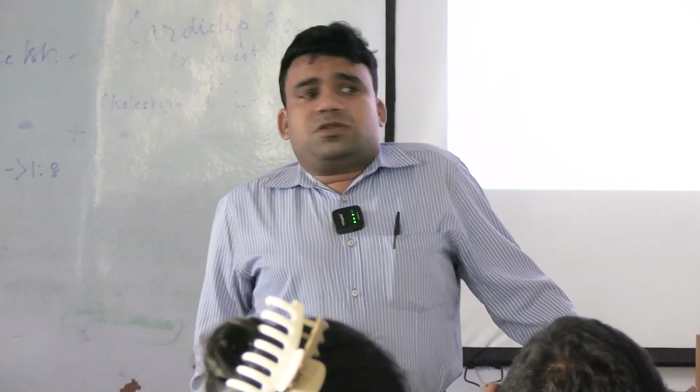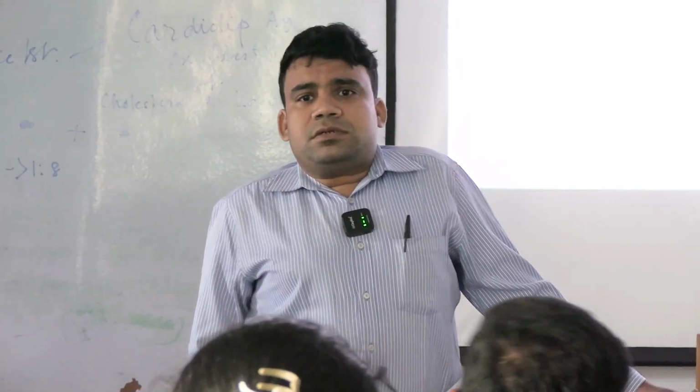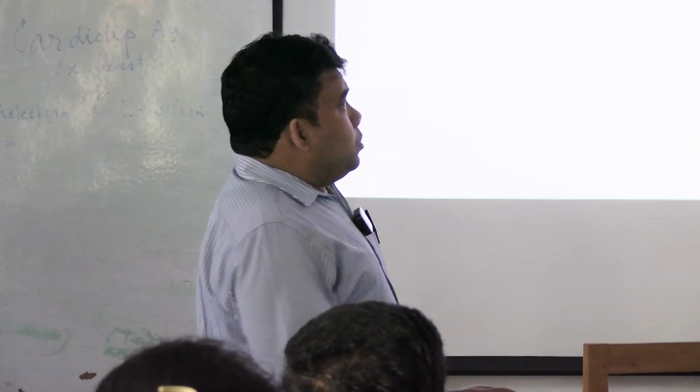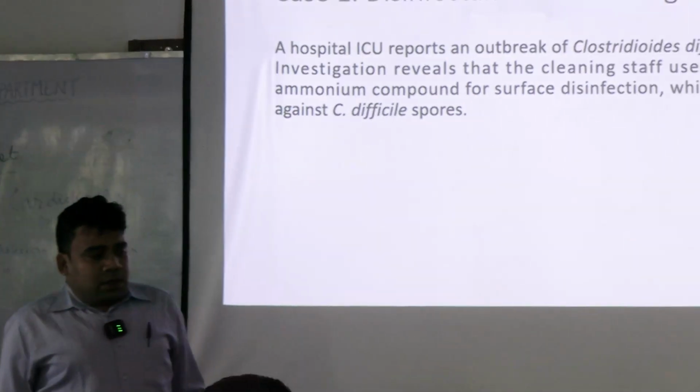Today we will get the first exposure of a practical, that is our staining method, commonly known as the Gram staining method. Okay. So let us look at this question.